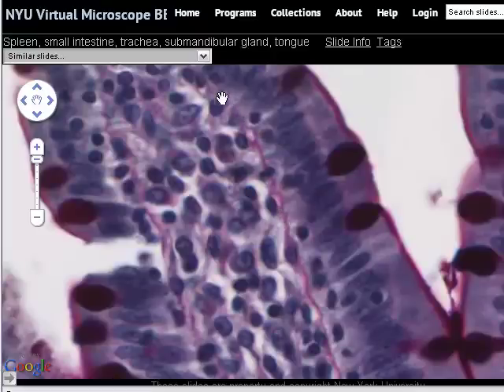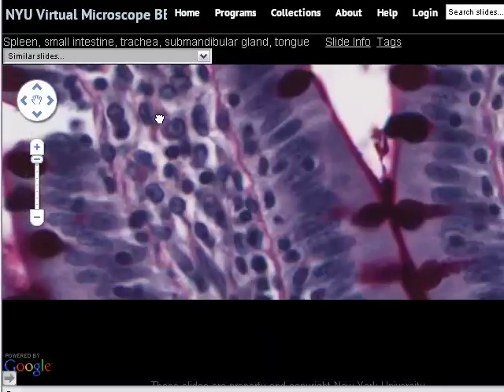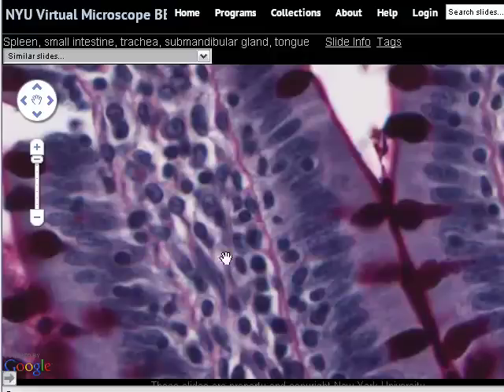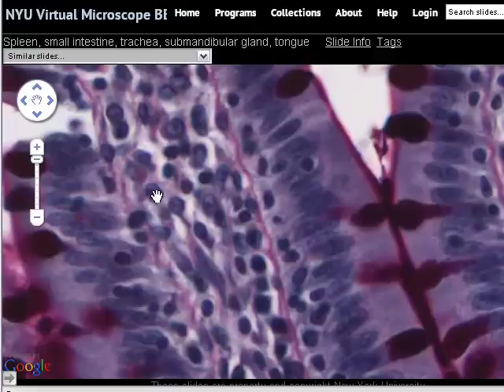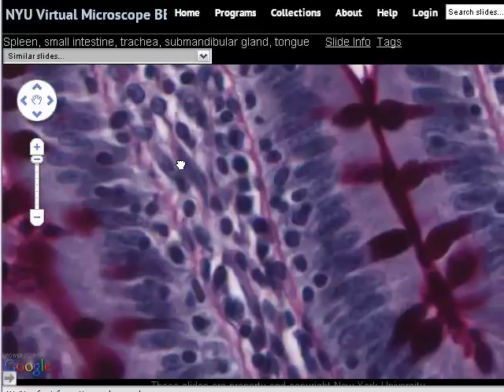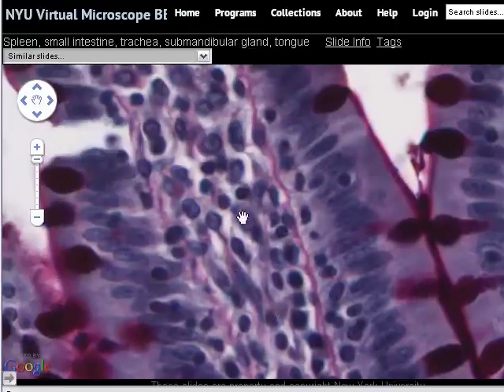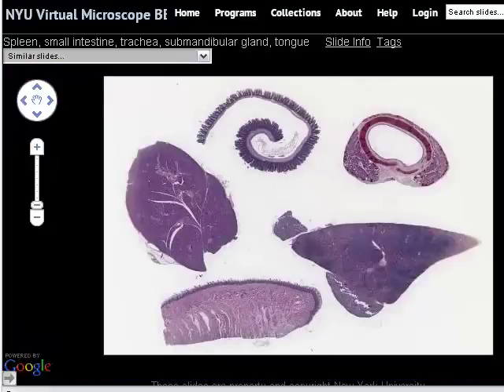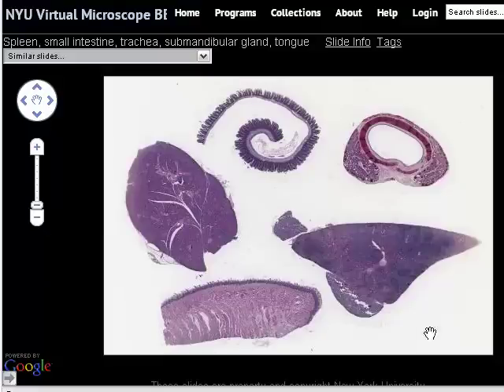Along here is where the basement membrane is — this red staining here probably represents at least part of the basement membrane. In the core of the villus, you can see some thin pink thread-like material which is collagen, forming the fibrous component of the connective tissue. Everything else are cells embedded in the connective tissue: some are fibroblasts making the loose connective tissue, but many of the cells in the core are in fact immune system cells migrating to and from the epithelial surface.